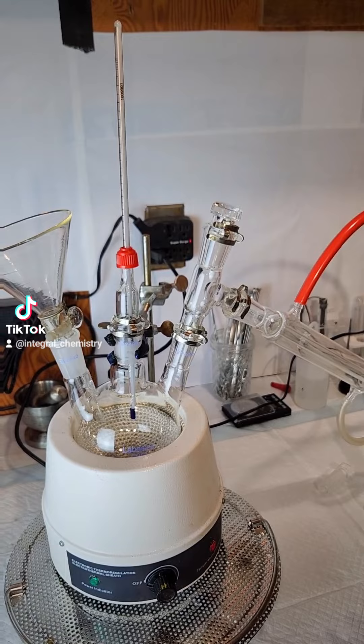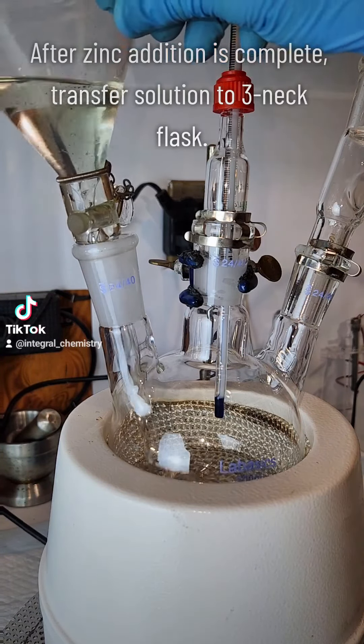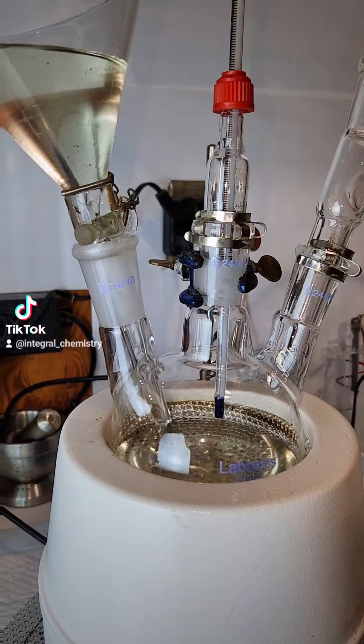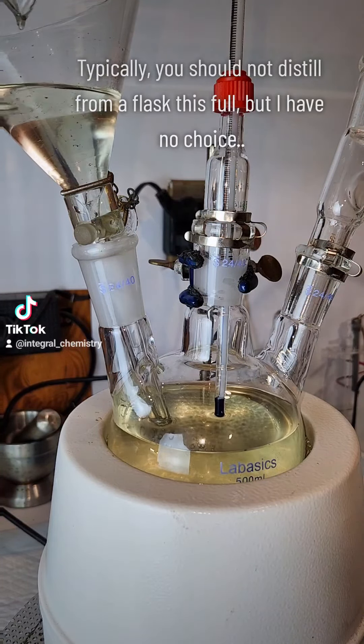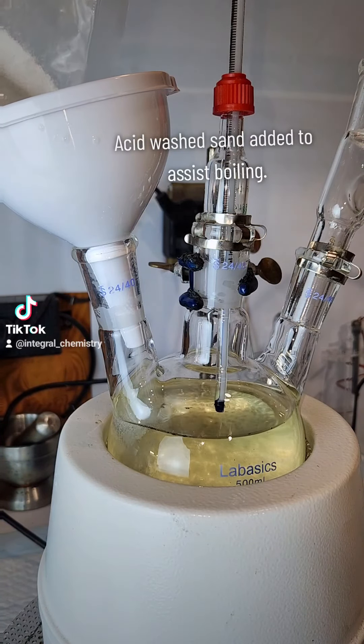Once I've added the last of the zinc metal, I construct this basic distillation apparatus and slowly add all of my extremely crude DCM to the three-neck boiling flask. Just as a side note, you typically never want to distill from a boiling flask that's this full, but I don't really have a choice here, so I'm going to try to make it work.